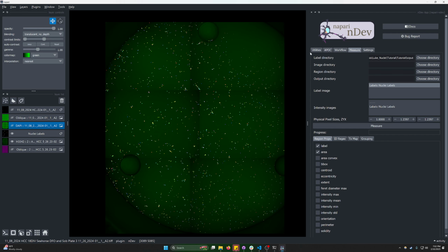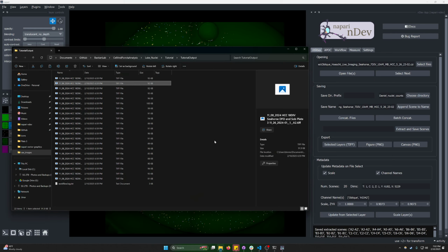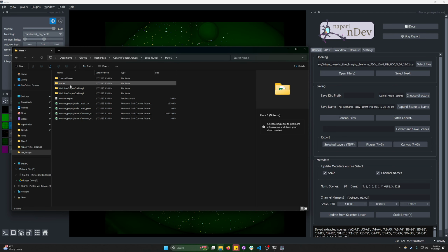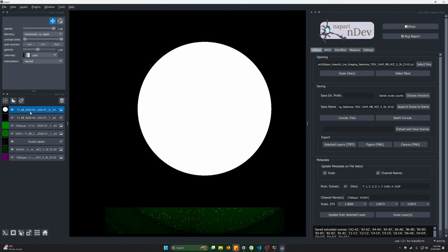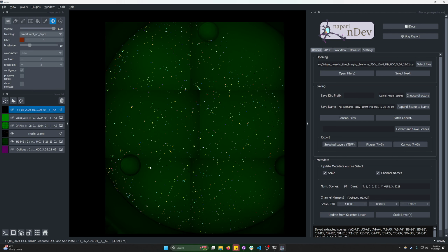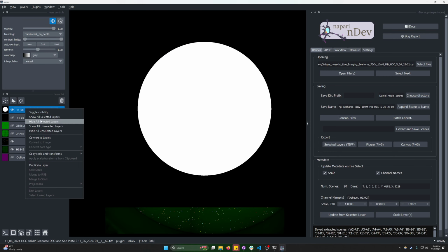Oh, there's one more thing that we needed to do. Previously, we had added a region of interest here of where we want to measure. It's just sort of in the middle of the well. Oh, this isn't scaled properly to this image. Let me pick the one for the image itself. We'll grab the second one. This should be in a slightly better position.